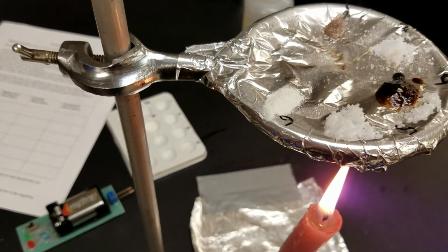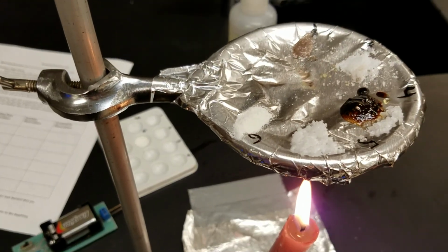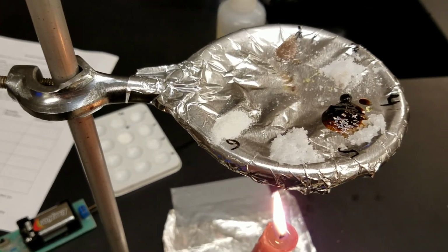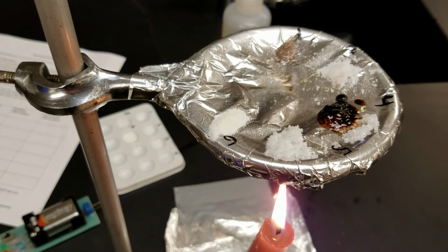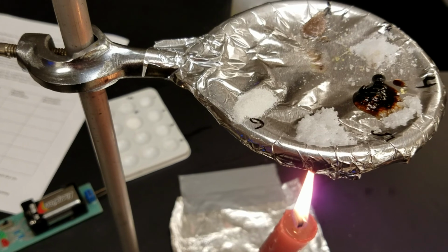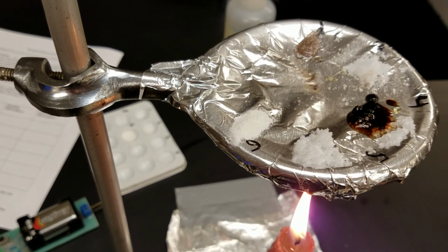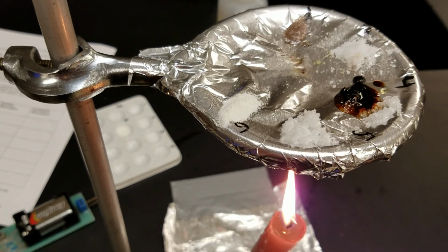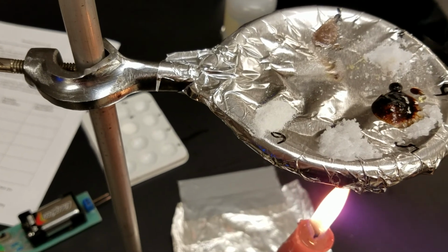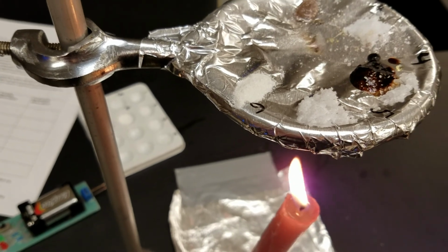This is table salt. I wouldn't expect it to melt, but we'll test and see. Table salt's melting point is listed as 1,500 degrees Fahrenheit, or roundabouts. I don't think our tiny little candle is going to get that hot, but we'll still test it anyway. Again, just like calcium chloride and the potassium iodide, nothing is happening. It's not melting, it's not even turning color.